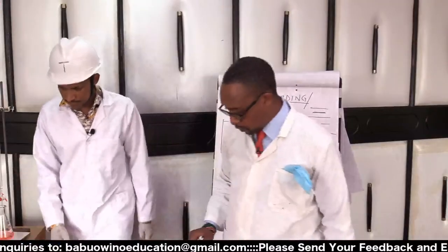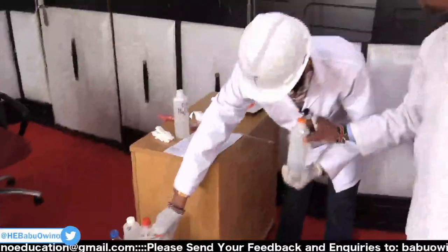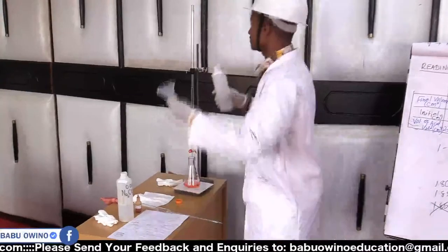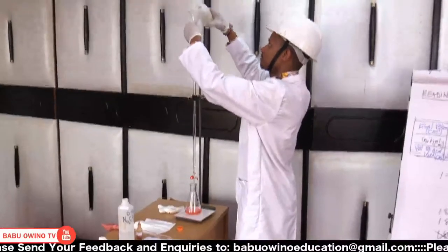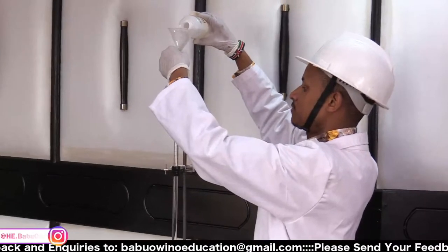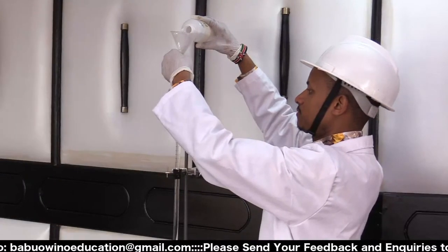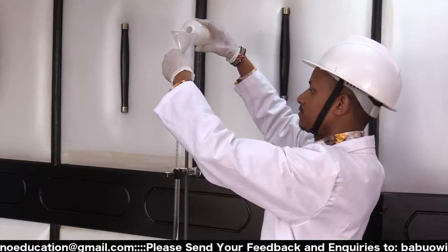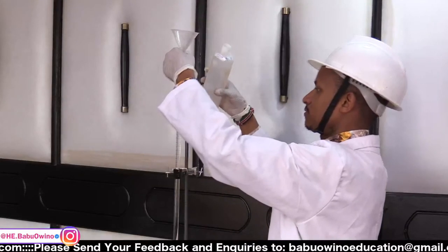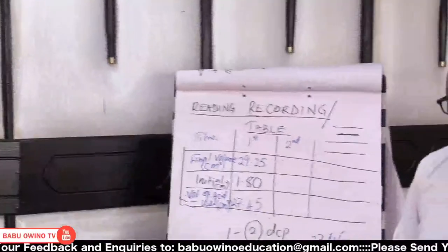So we take our solution, the acid, and fill it in the burette so that we carry out another titer. We want to carry another titer so that we are consistent. So this is what we are calling titers. The titrant reacts with the analyte. From the burette, titrant. From the pipette, analyte. Therefore, what we get here is a titer. Once we repeat that, we get another second titer. This process is also called titration.